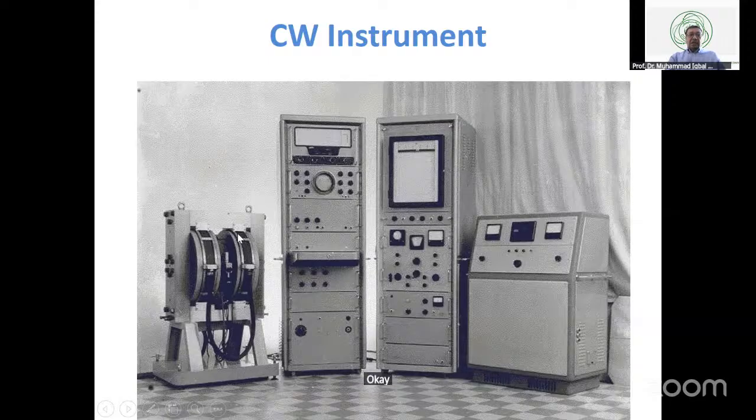Okay, and this is a chart. This is essentially paper scrolling. And there are so many knobs here. And these knobs were largely sweeping radio frequency, which you can see on this particular meter.